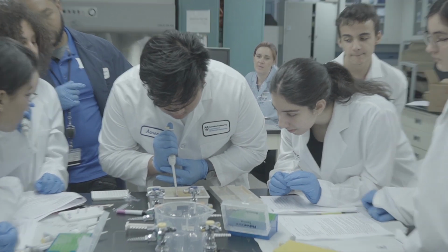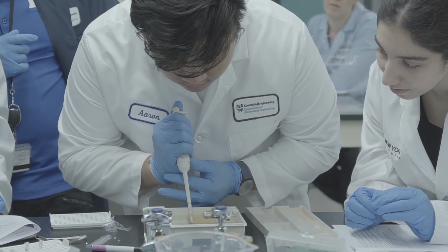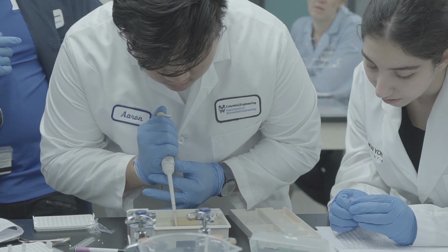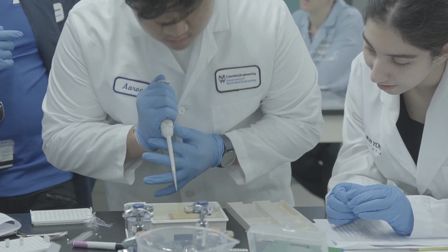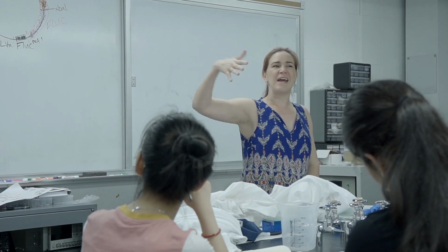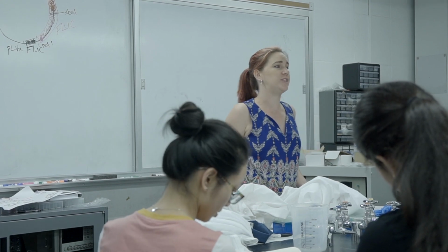So we're running the gels now, and it's going to take about 45 minutes or so for those bands to separate enough that we can see them in the gel. So what I wanted to do while we're doing this is give you a real life example of how we would use these experiments and what the next steps would be. And these are really common things that you would be doing as an intern just starting in a lab.